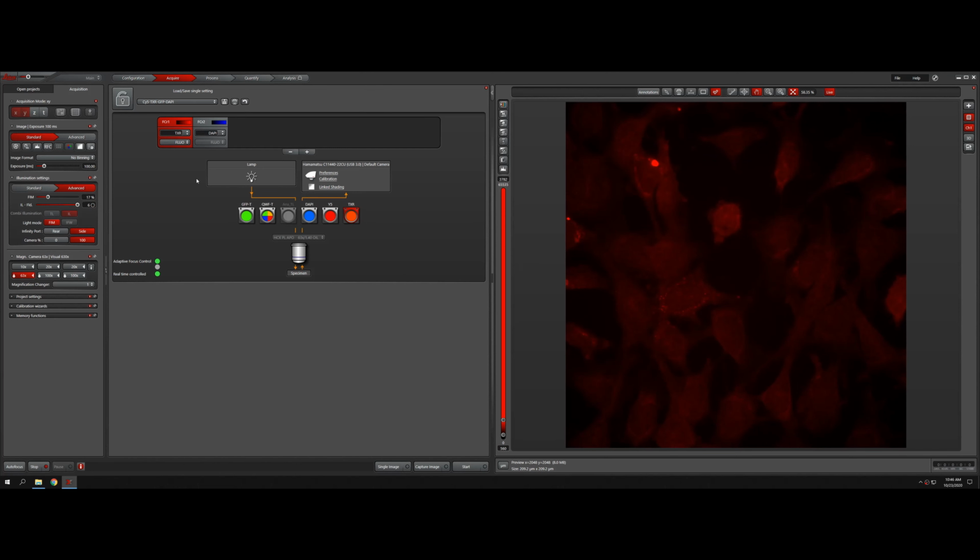General audience, I'm going to demonstrate the LAS X Navigator, which is here. Very useful tool. So the system has been initialized, including the stage initialization step. If you remember, during startup it asks to initialize the stage or not, so you have to select yes in order to be able to use these stage experiments.